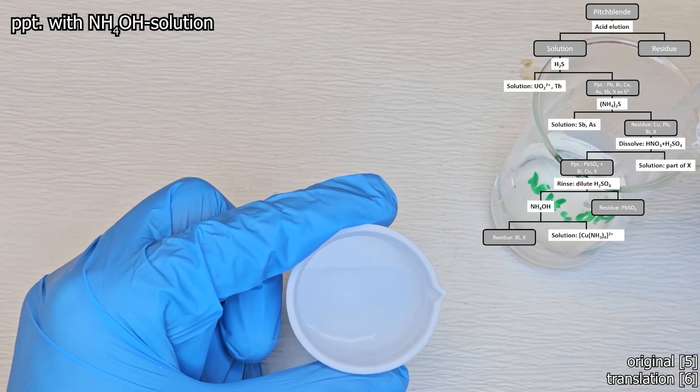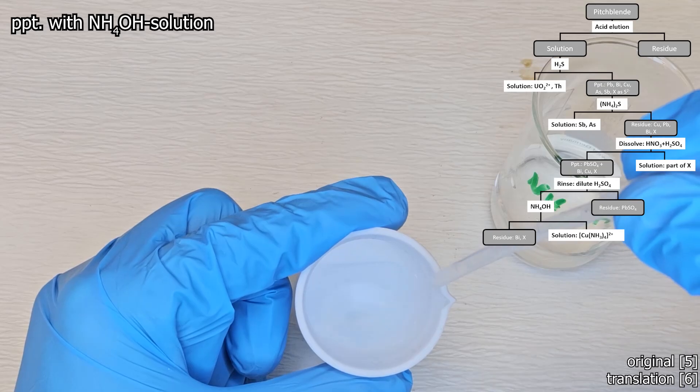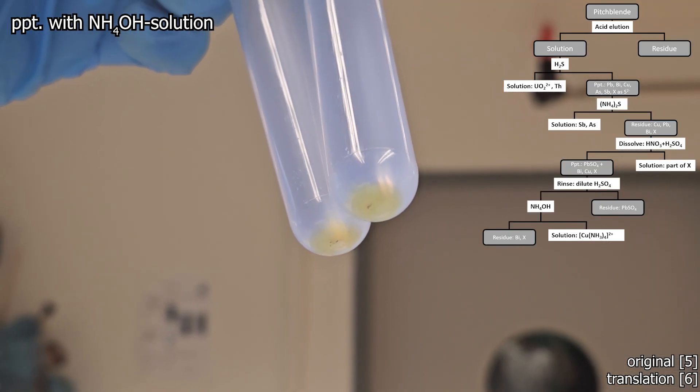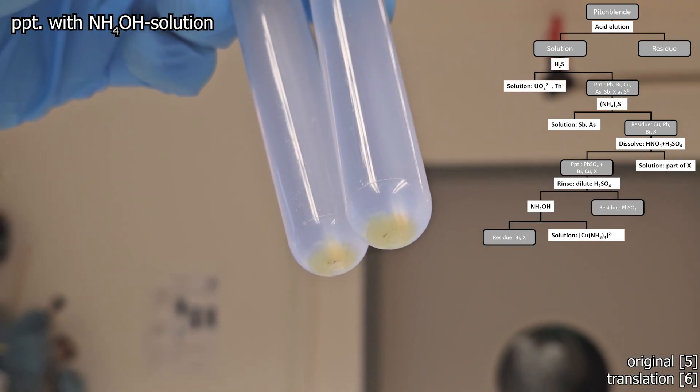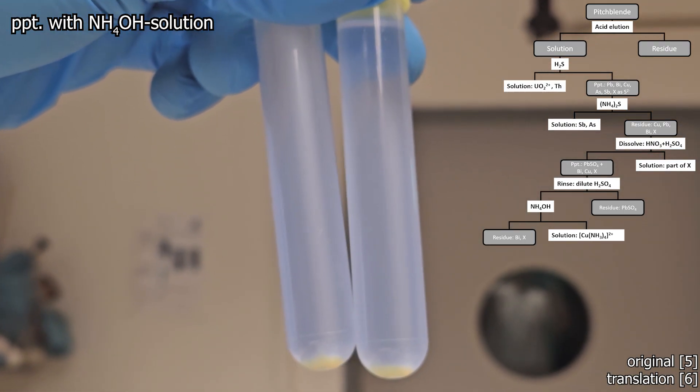Here you can see the beautiful formation of the deep blue tetraammine copper complex which is also a great indicator for us when this solution is alkaline. The whole thing is then centrifuged and at the top we have the tetraammine copper solution and at the bottom we have a yellow residue.